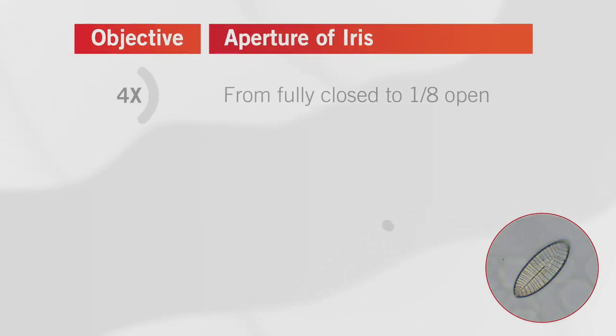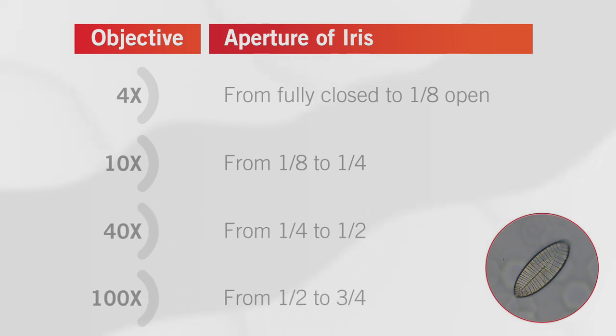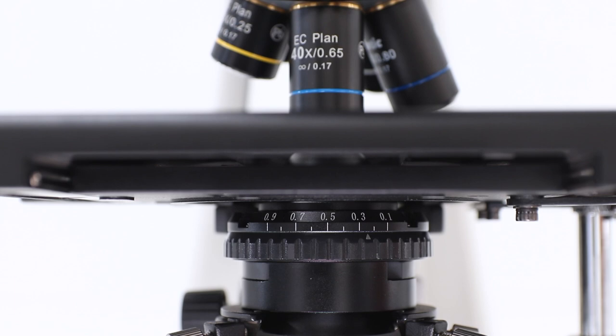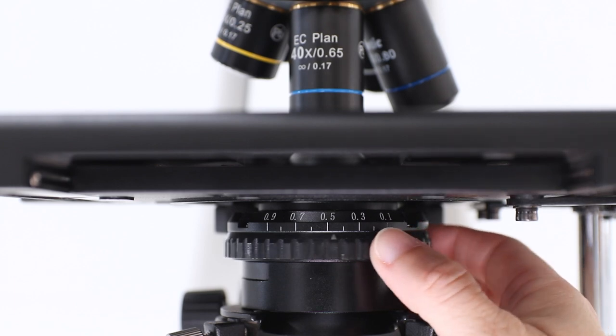Adjust this to suit your needs and requirements. Depending on the sample, more brightness or more contrast might be needed. Some basic microscopes do not have an iris diaphragm indicator. In this case, these suggestions should be used as a guideline to achieve the best illumination. These steps should be repeated each time the objectives are changed.